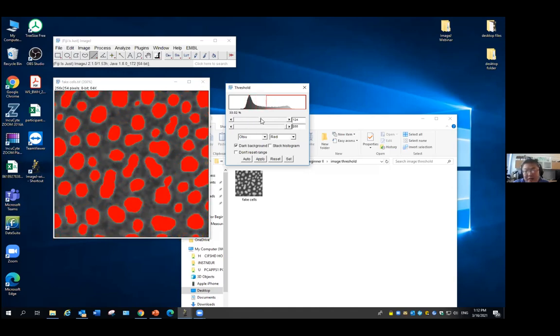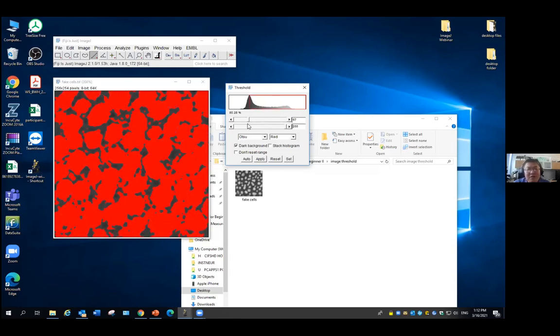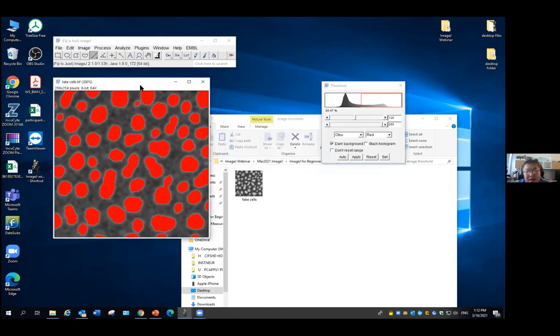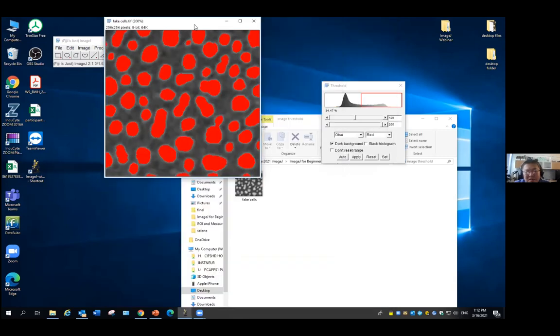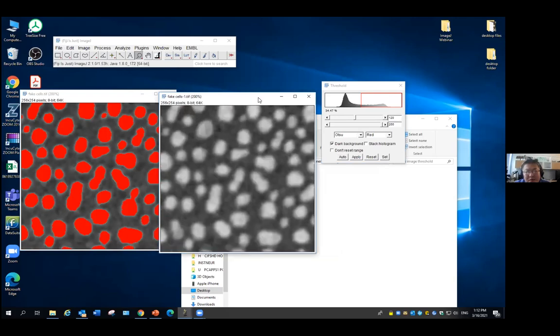Our goal is to set up the value. This one apparently is not good, it's too high. This one will be too low. I will try to set up a value which I think is a good one, one that represents what I am actually looking at humanly. I open here again, so we can look at them one by one.